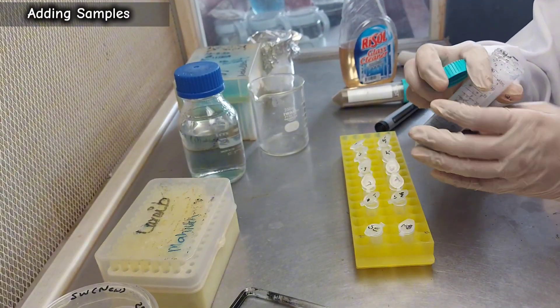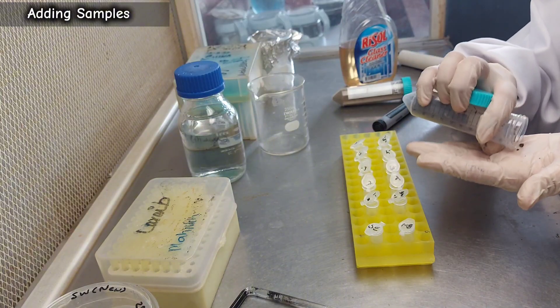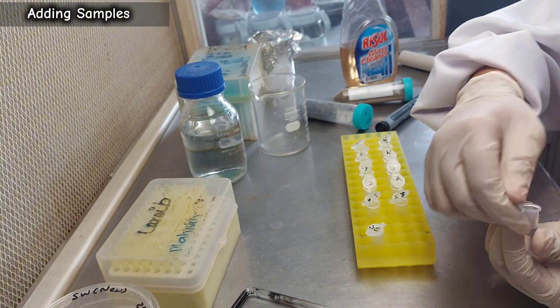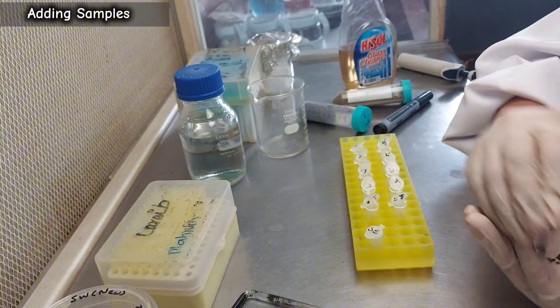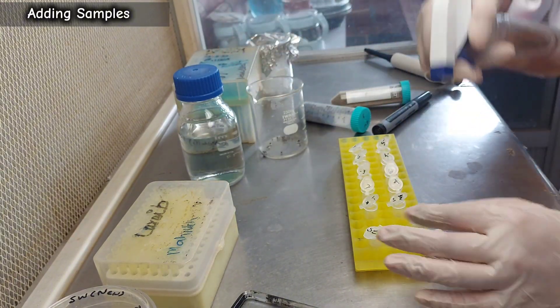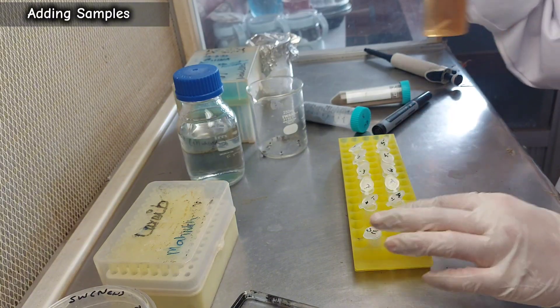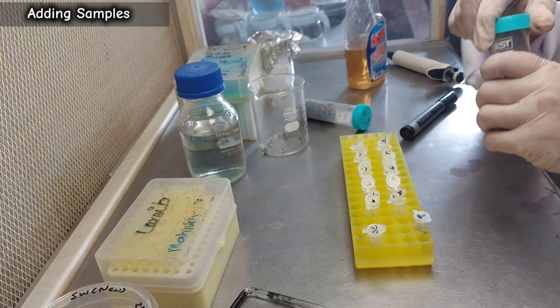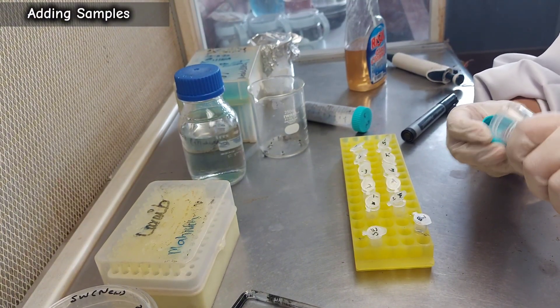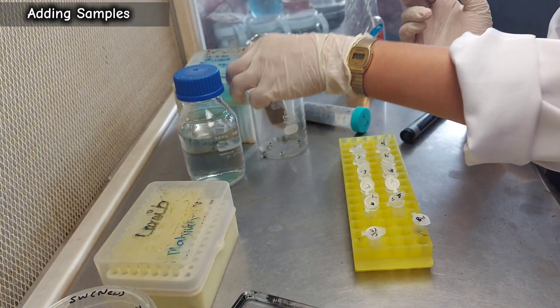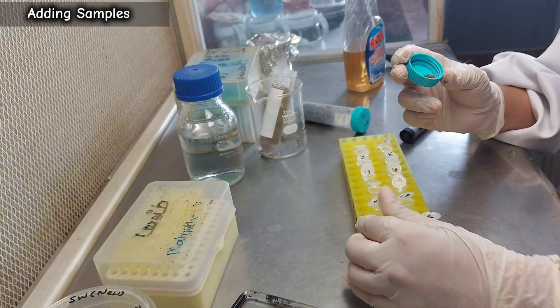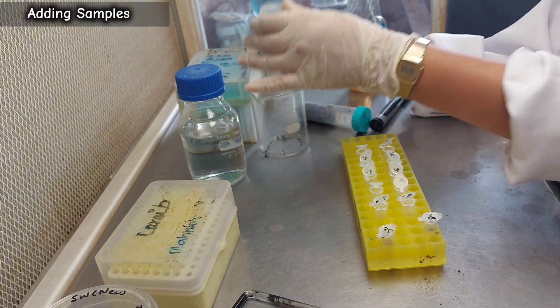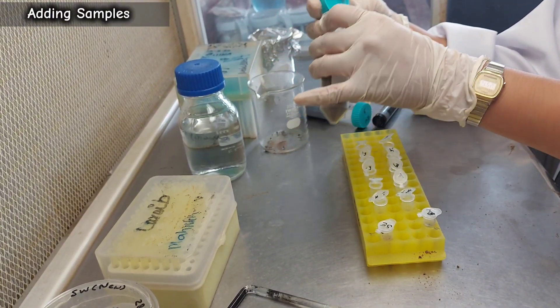If you're using a soil sample, take a small amount and add it into the stock tube. If you're using a water sample, add 100 microliters from the sterile falcon tube into the stock tube. Ensure your gloves and work area remain sterile throughout this process.